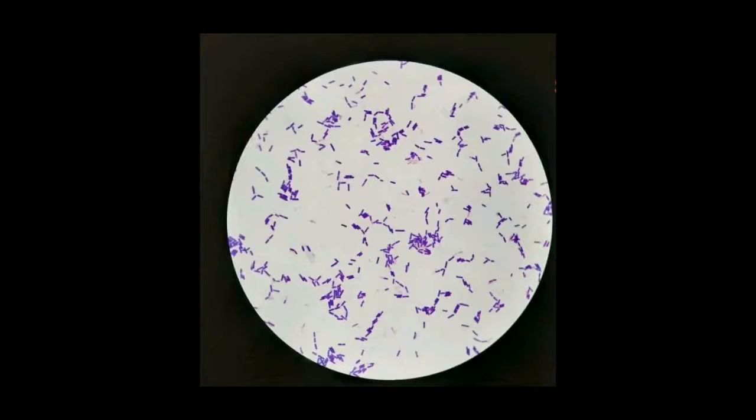Once the slide was air dried, we observed the slide under the microscope at 100x. On observation, we found the presence of purple colored, rod-shaped colonies, which indicates that the bacterial sample that was stained is a gram-positive bacilli. So this is how we perform the gram stain.